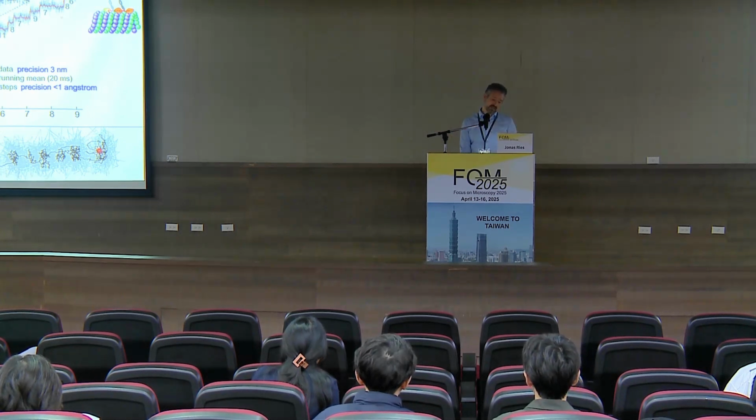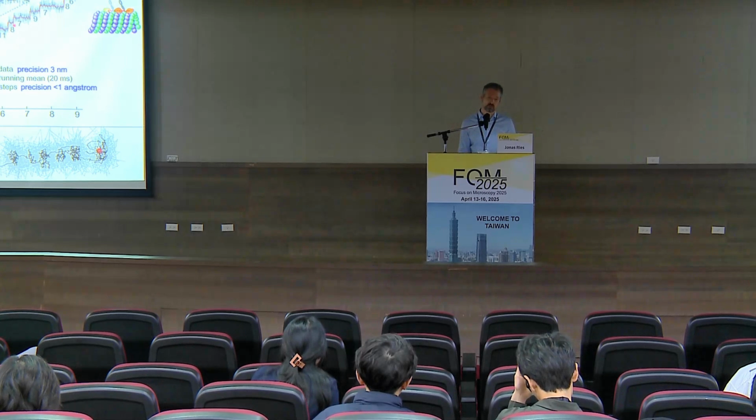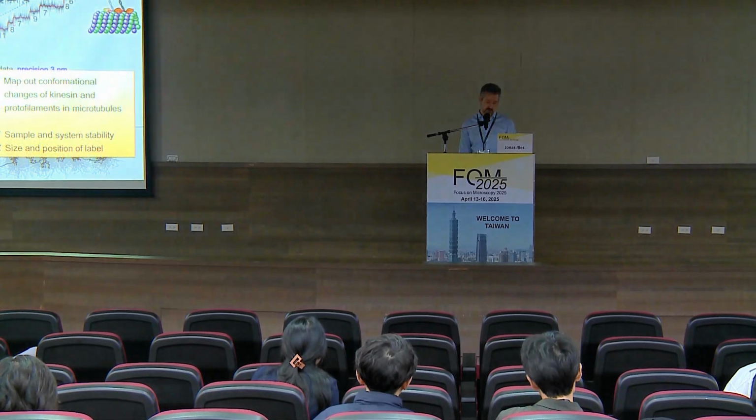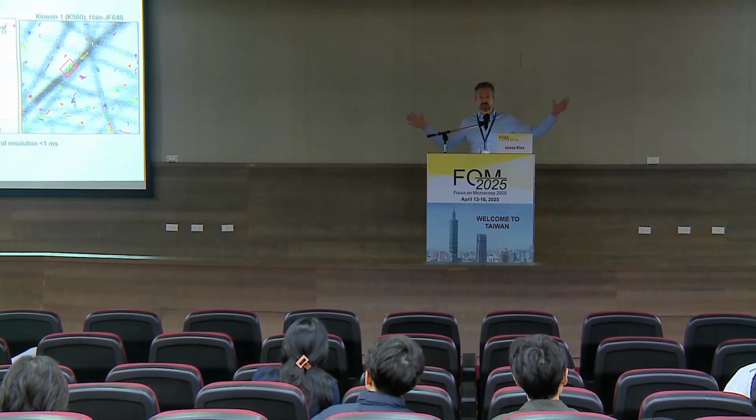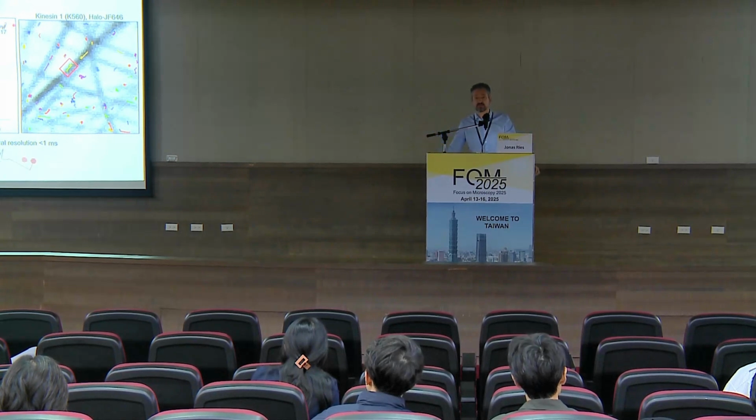For instance, here, if you can clearly distinguish these 8 nanometer steps, these half a nanometer movements might not matter so much, depending on your question. Or in the living cell, I think we are also rather limited by the shot noise, or sometimes by nearby fluorophores, by dirt, by something in the sample.